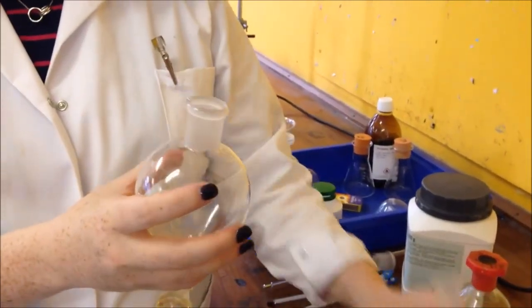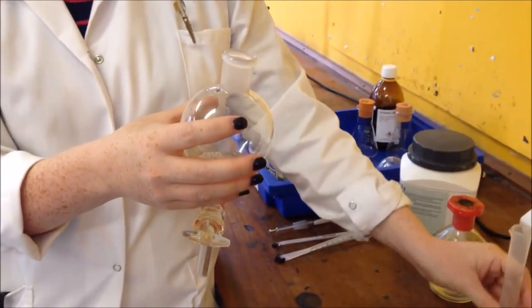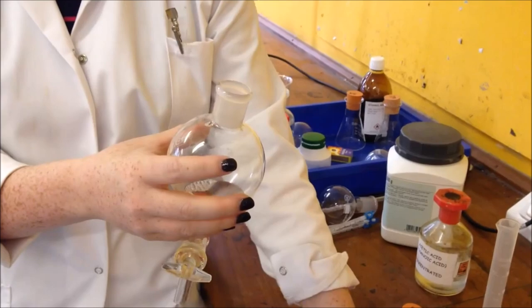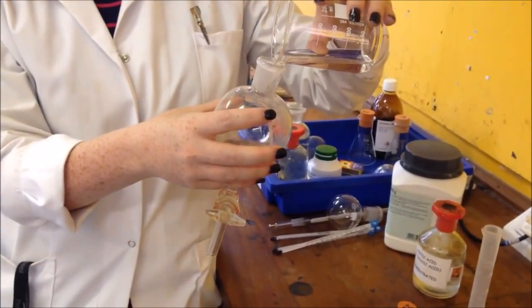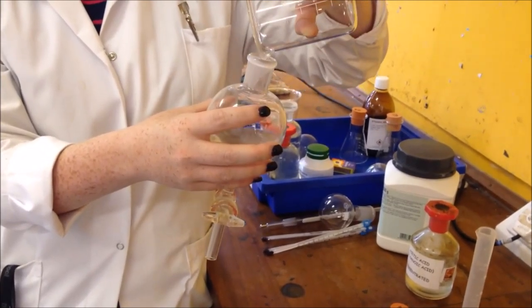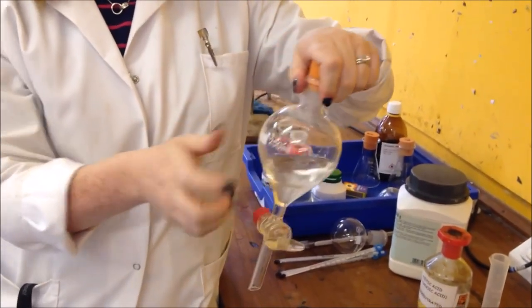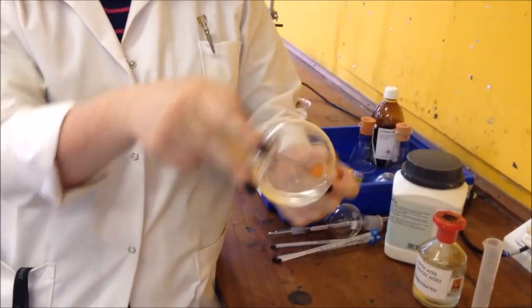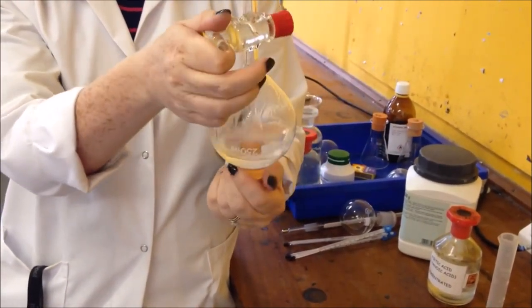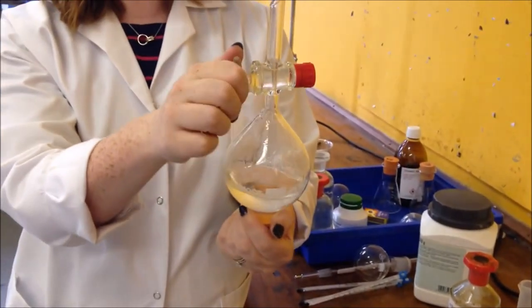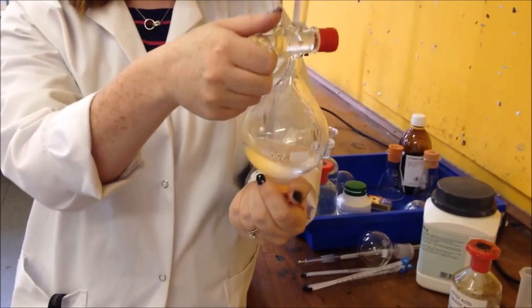I'm going to put the lid back on this. We're going to be inverting it so we need to make sure that it's quite secure. You're going to need to have quite a firm hold on this. Invert it several times to give it a mix and all you need to do is open the tap to release any gas that comes off. I would do this maybe two, three times.